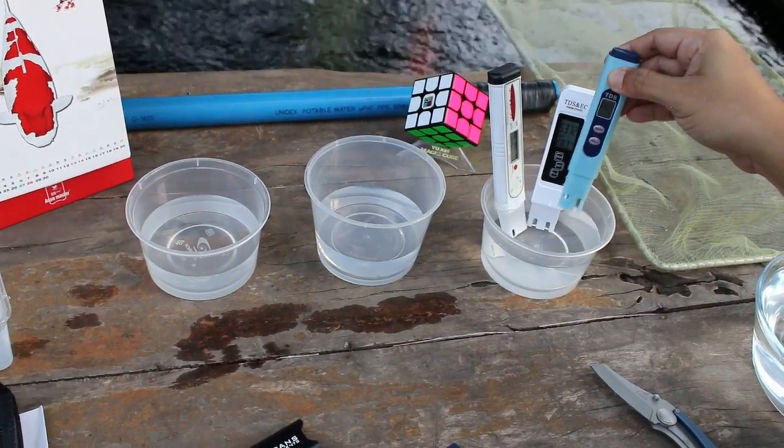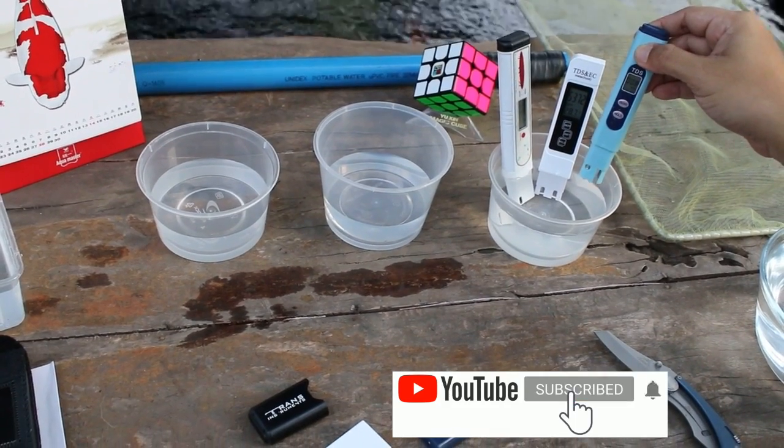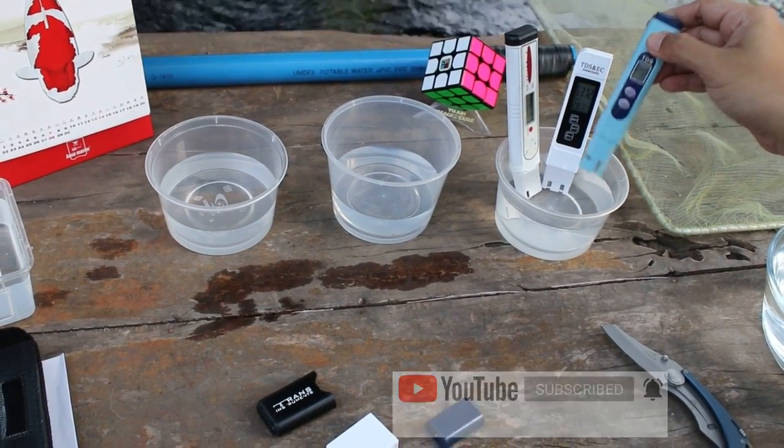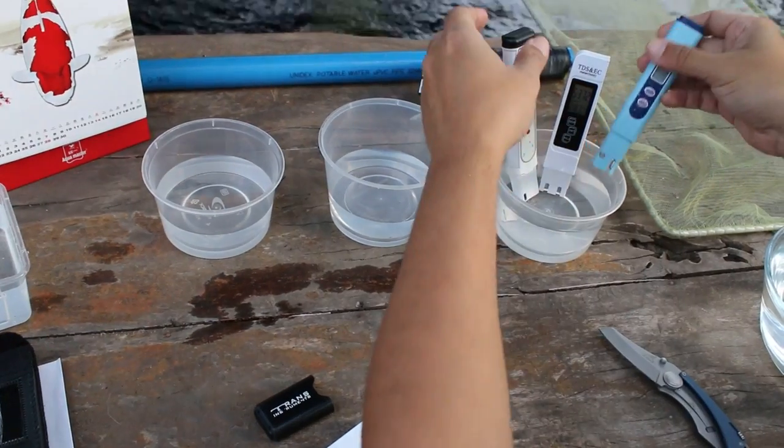Three different units with three different results, very different results. Let's take them off.